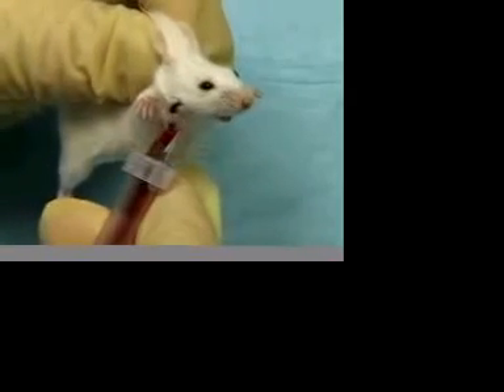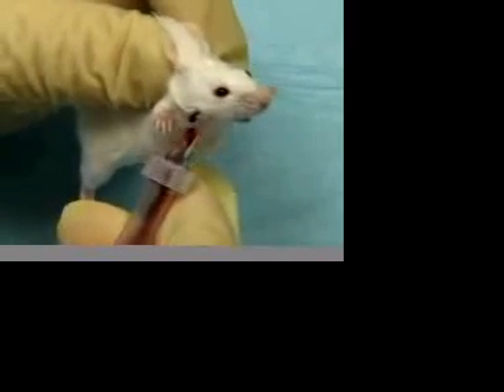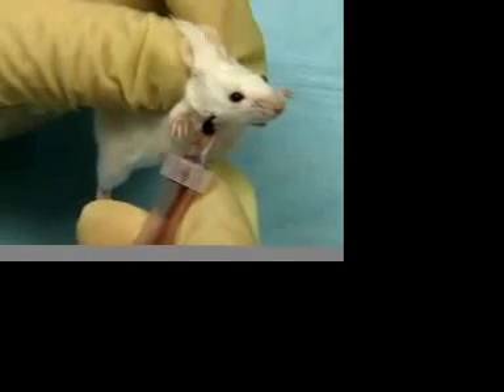Using inexpensive Goldenrod lancets, one or two drops to a half mil of blood can be quickly and easily drawn without hurting or losing the animal.